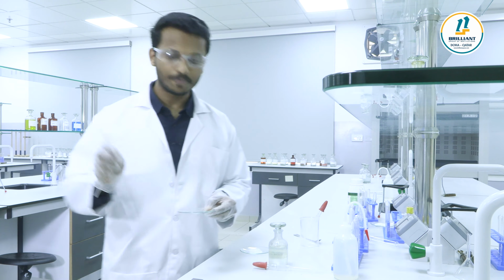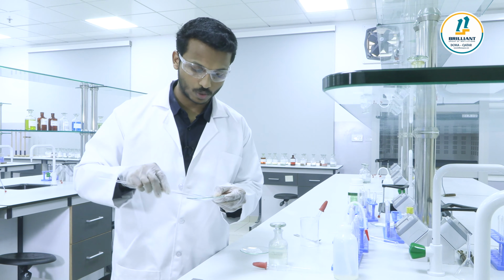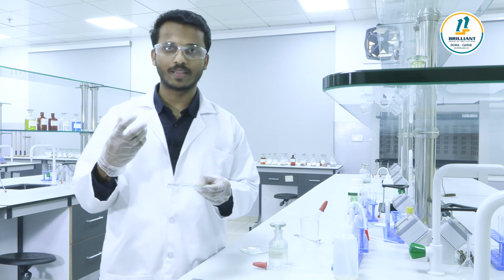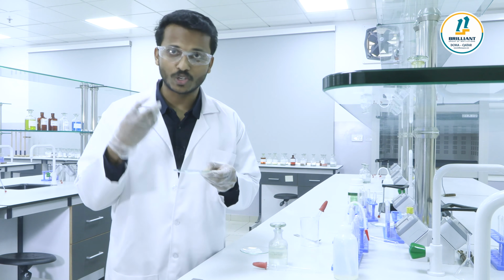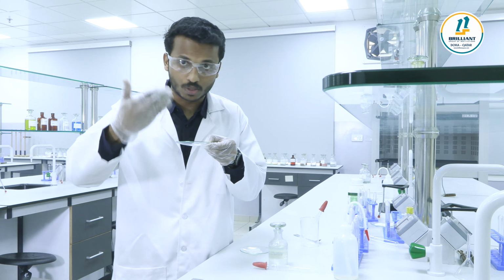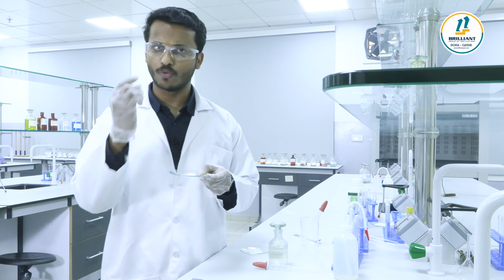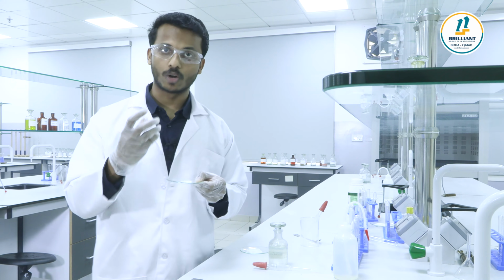Then dear all, rub this concentrated H2SO4 with the salt with a glass rod. Rub it well, and we have to get the odor of this salt. When you're trying to get the odor, please don't smell it directly. Try to get the odor through a wave. Smell it, we'll get an acetate smell, a vinegar smell.